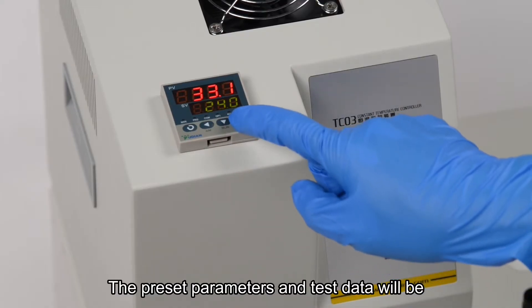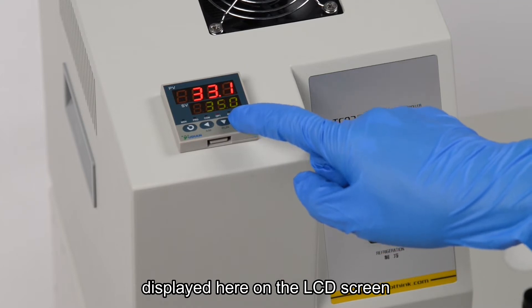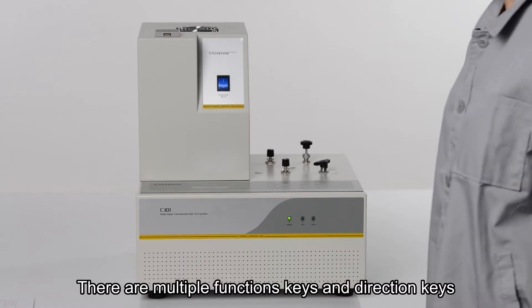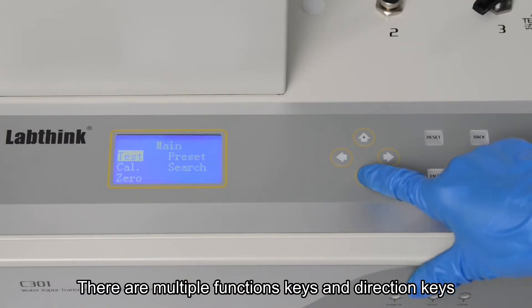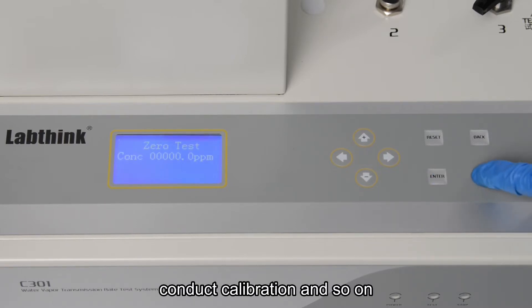The preset parameters and test data will be displayed here on the LCD screen. There are multiple function keys and direction keys on the operation panel. By pressing these keys, we can start or stop the test, preset the parameters, conduct calibration, and so on.